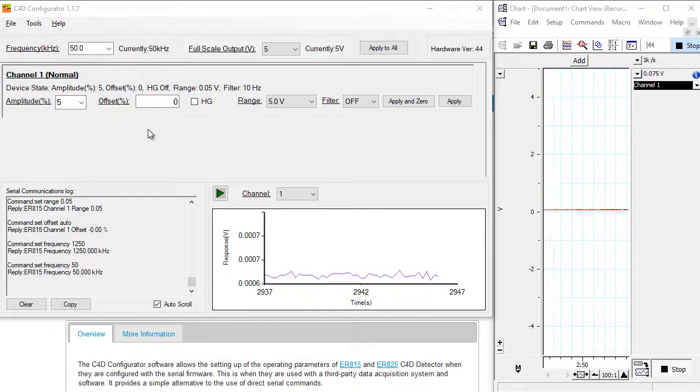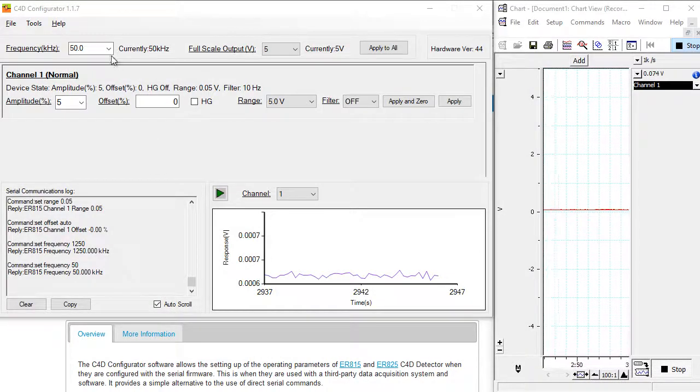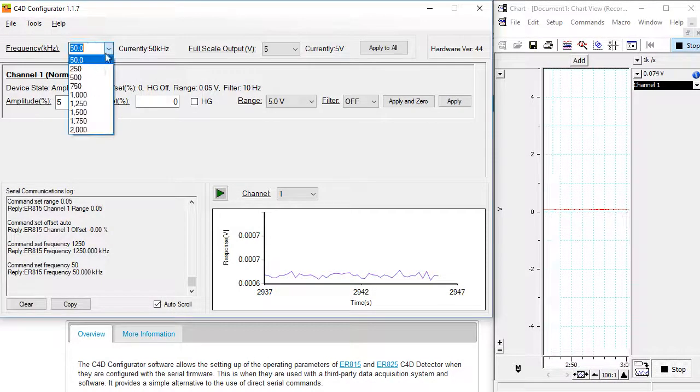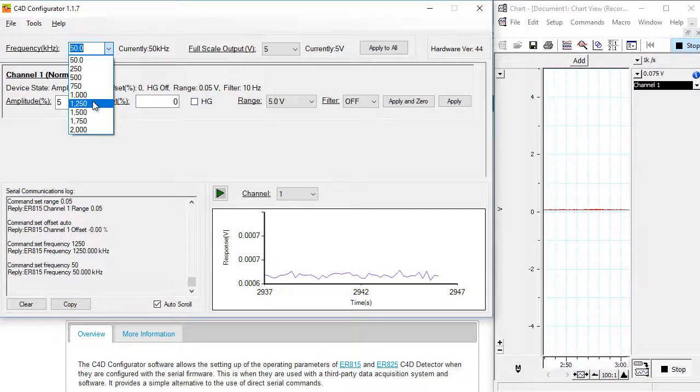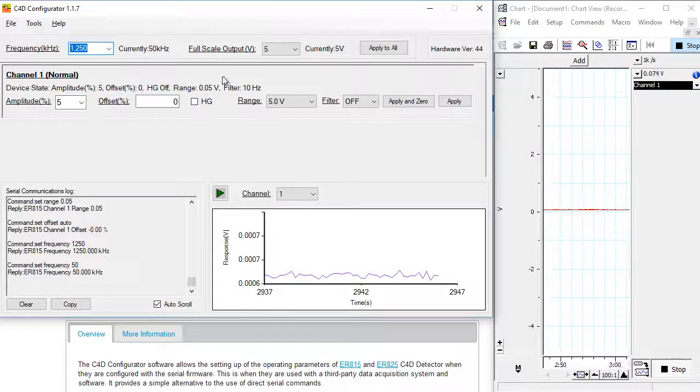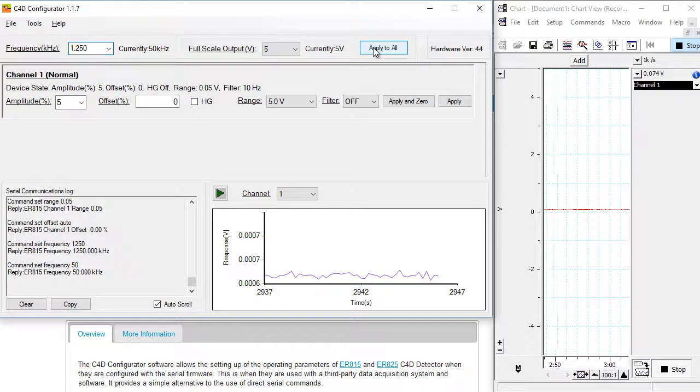You can now enter the C4D settings. You enter the frequency here, click apply to all.